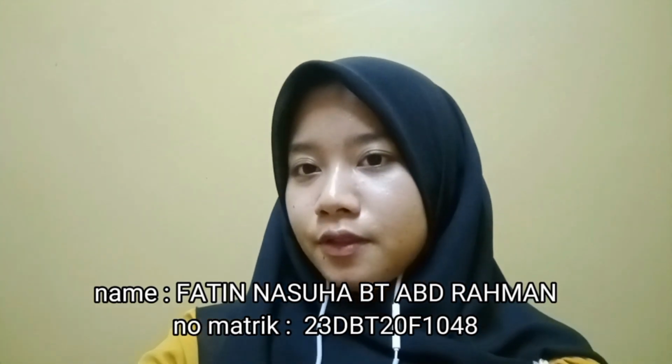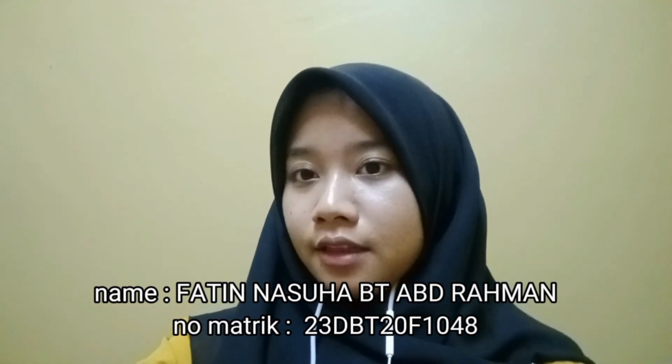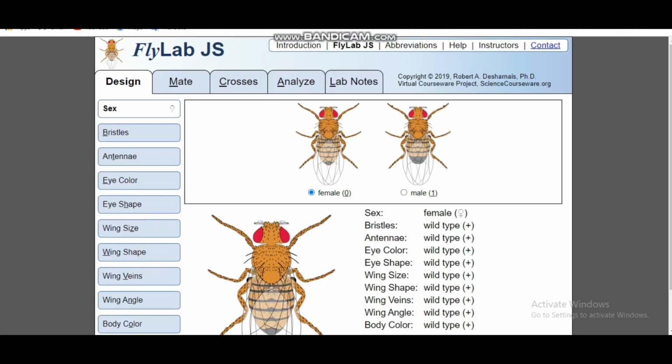So today I will do how to collect data from virtual lab.